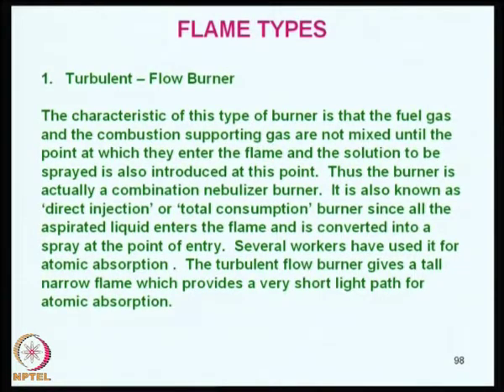In the turbulent flow burner, the characteristic of this type is that the fuel gas, the combustion gas, as well as the sample are introduced only at the tip of the burner. That means they come from different sources, are put into a uniform cone, and then released simultaneously at the tip of the burner.